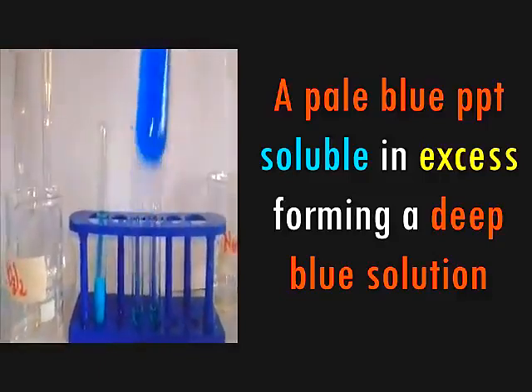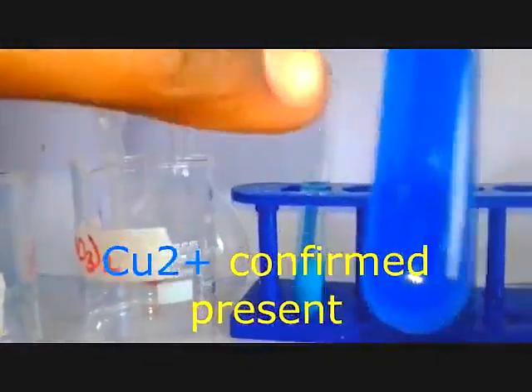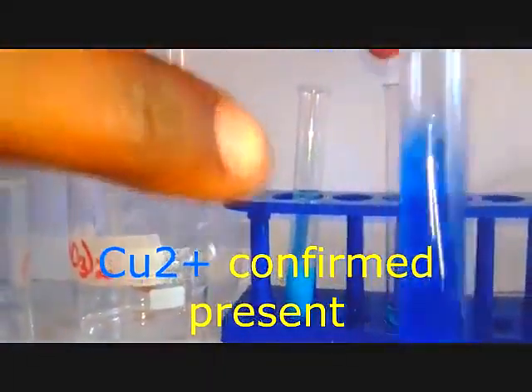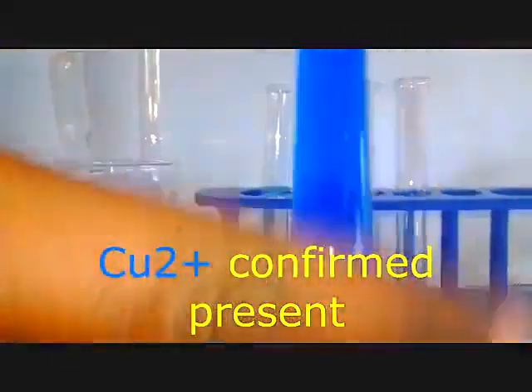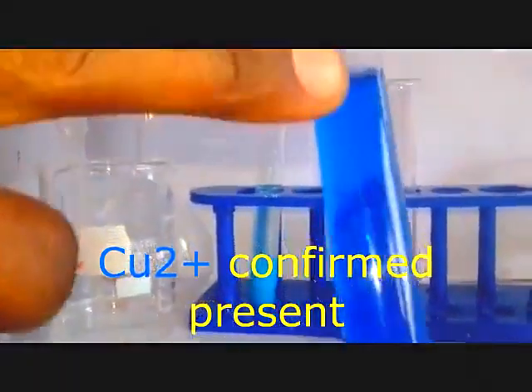So in this case, our first pale blue PPT is soluble in excess aqueous ammonia to form a deep blue solution. So it means here we can confirm copper, because it's only copper which has this behavior.